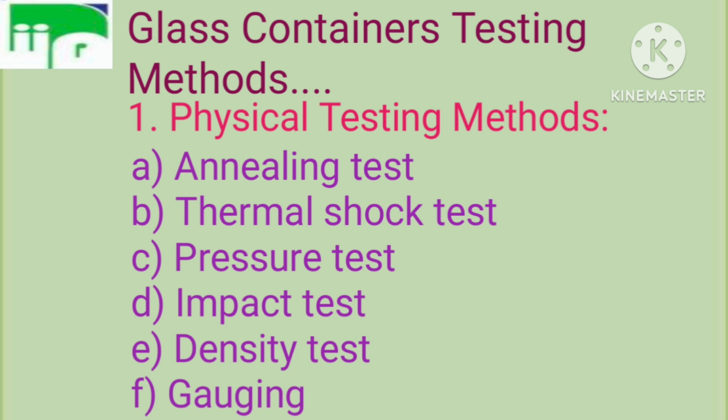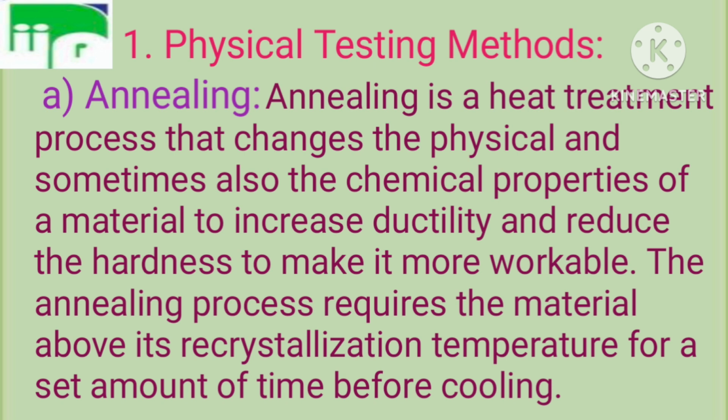So, if we are talking about physical testing methods, first is annealing test, thermal shock test, pressure test, impact test, density test and gauging. So let's talk about annealing.